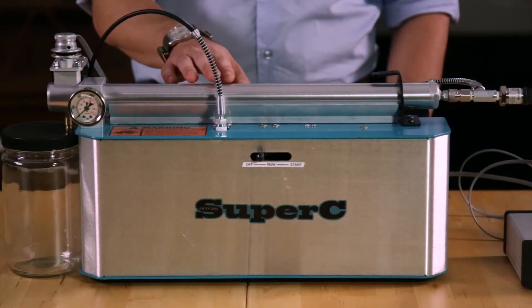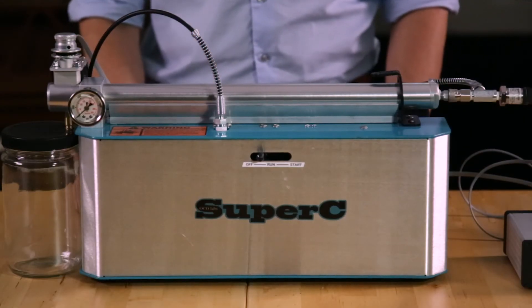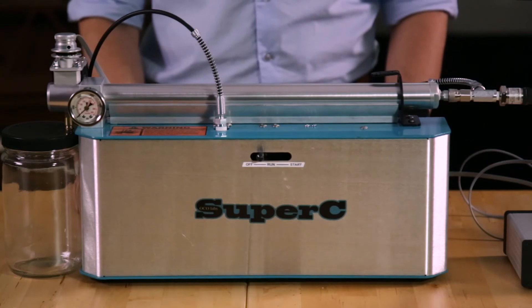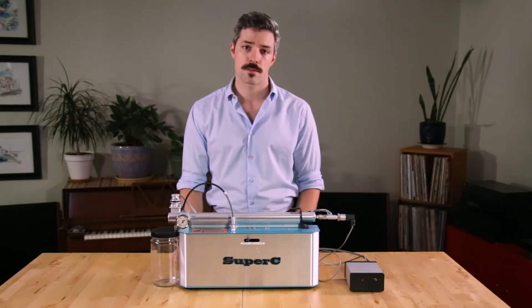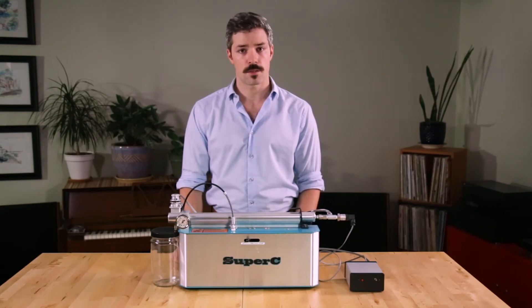The base model comes with a standard chamber which can hold about one ounce of dry ground material. Runtimes for an ounce of material can vary pretty widely from 45 to 90 minutes, and most extractions can be performed in a little over an hour.